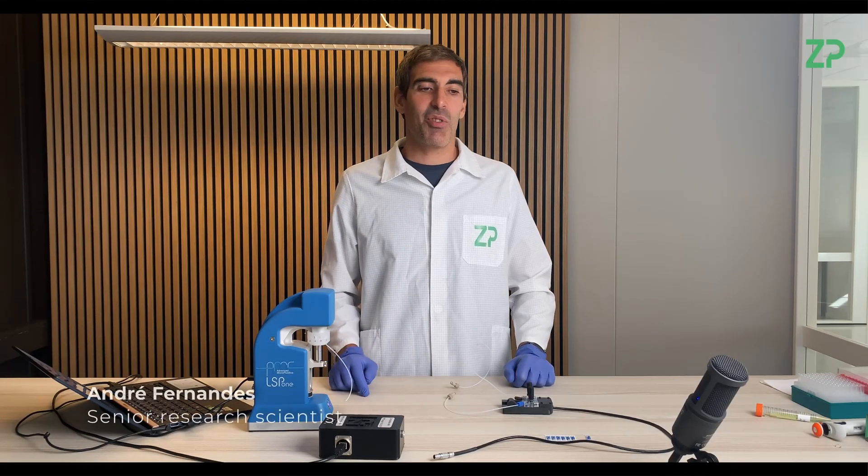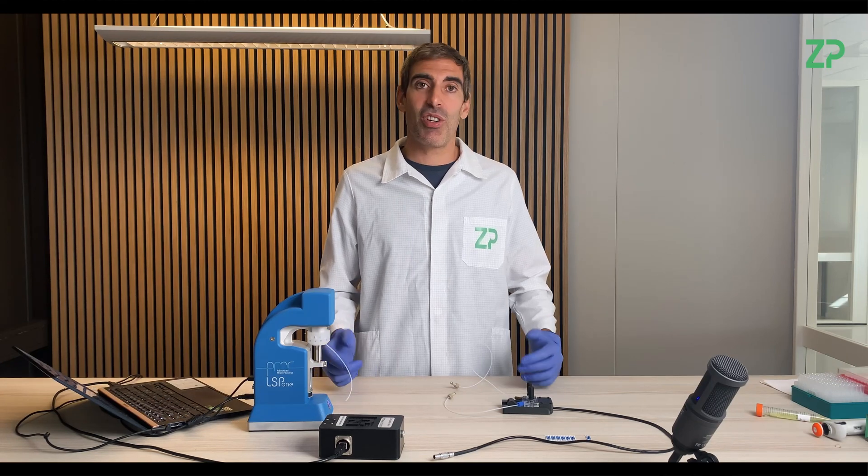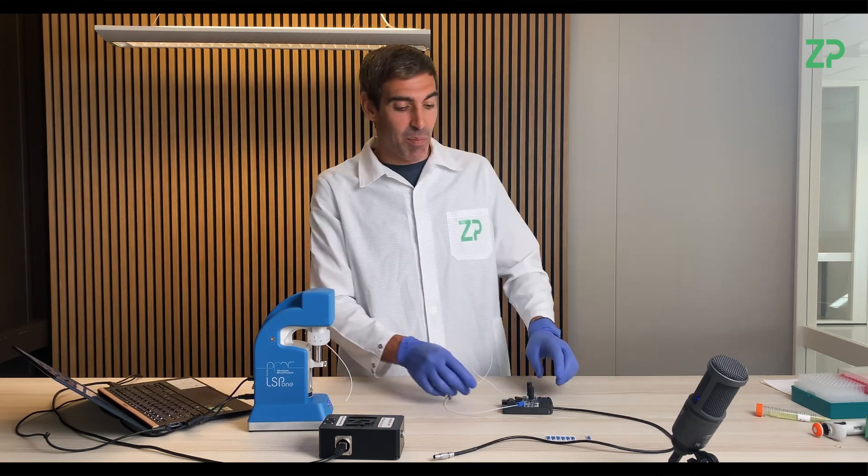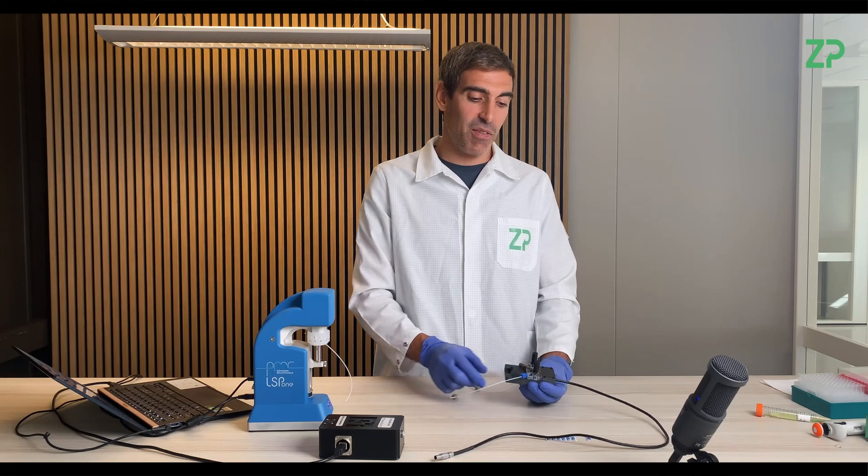Hello, my name is Andrea Fernandes. I'm a research scientist here at Zimmer & Peacock and today we're going to demonstrate the new capillary fill adapter that Zimmer & Peacock has developed.